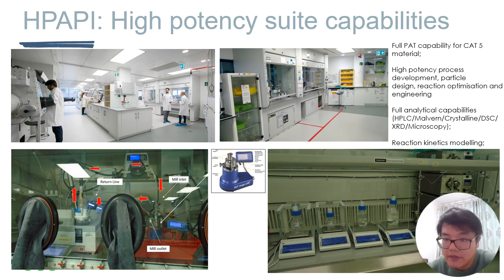To enhance the mixing for reaction, 3D printed static mixers were applied. And a flow cell was assembled at the outlet of the flow reactor to accommodate FTIR or inline UV in order to track the concentration of species of interest.